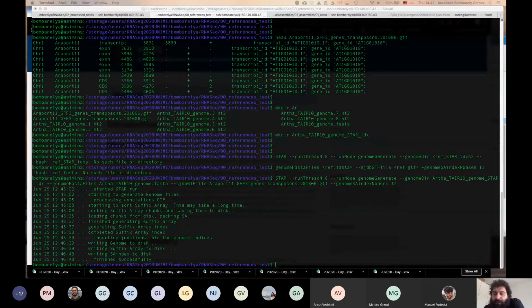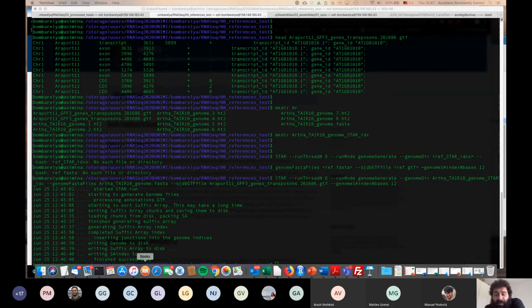Perfect, well, I see 10 people that already got it, 11, 12, perfect. Happy to see it. So wonderful, at least a third of the class was able to run this.